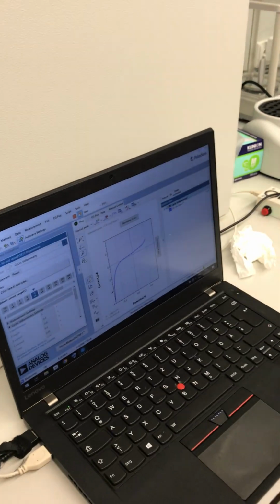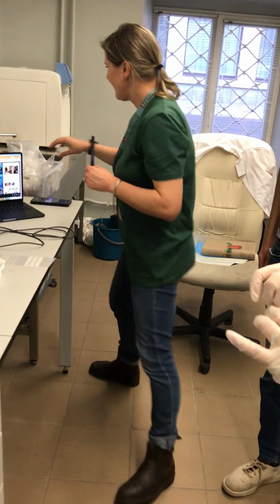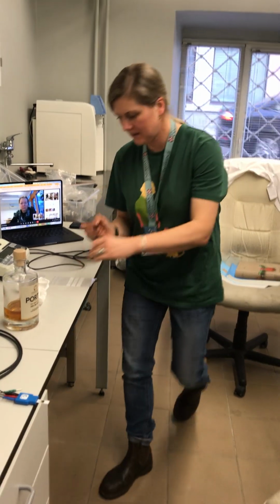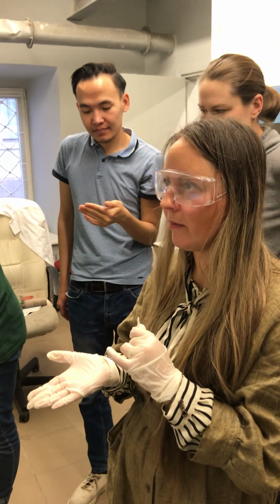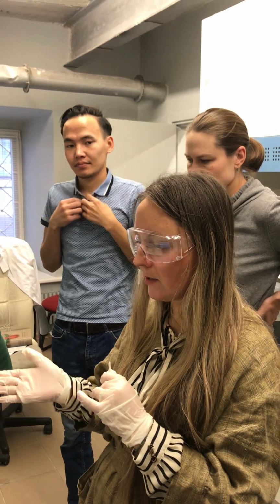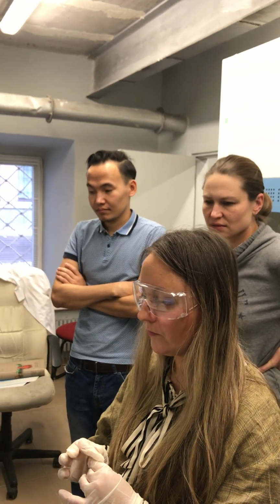So Deep Scientific is getting into archaeobiology. Bioarchaeology. Oh my god, I'm so sorry. Because now, since we discuss our work, I think for a more precise experiment, I would run the ethanol measurement first, to make sure it's all together. Then later, one sample, another sample. The measurement itself just has to be optimized.